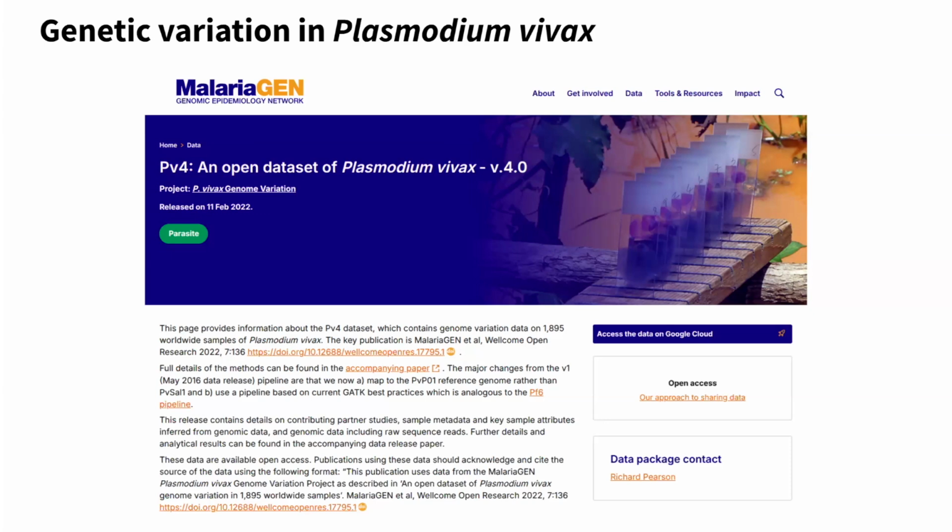So GEO, I know that there is a... is Peter asking about the results of a particular investigator, or in general about all GEO data sets? Because NCBI tries to convert some of the GEO data sets into actual gene counts, but they're doing this only for human and mouse.